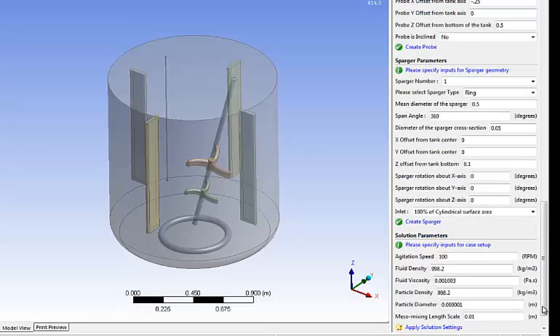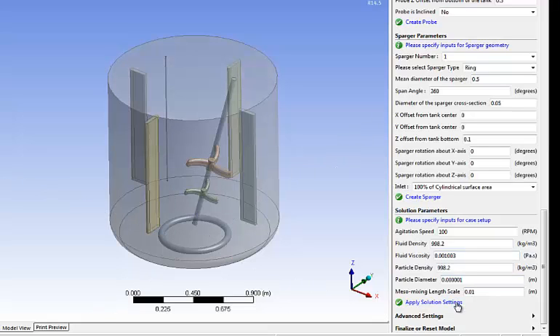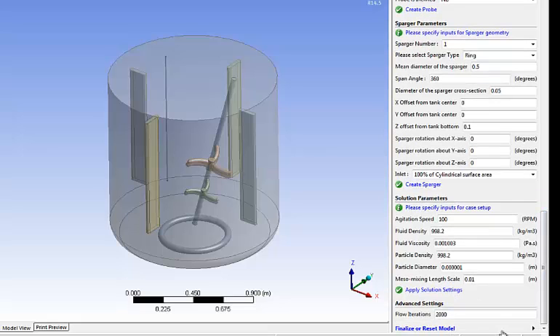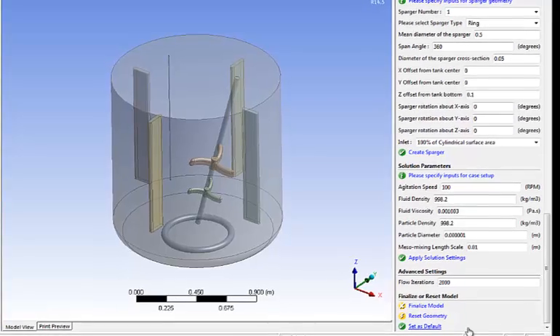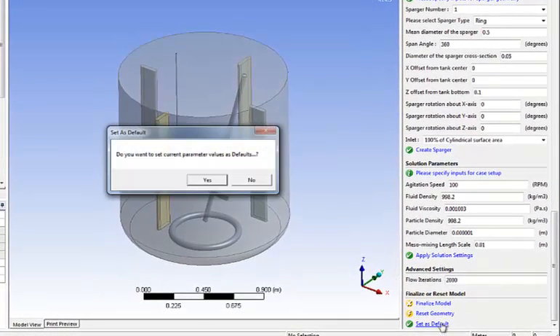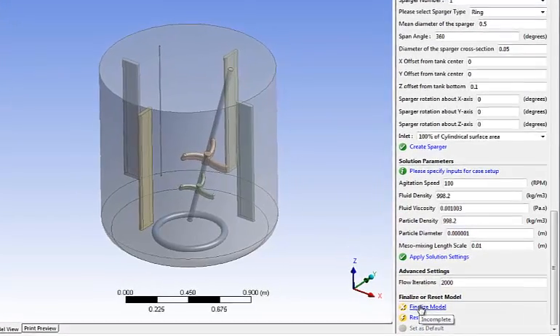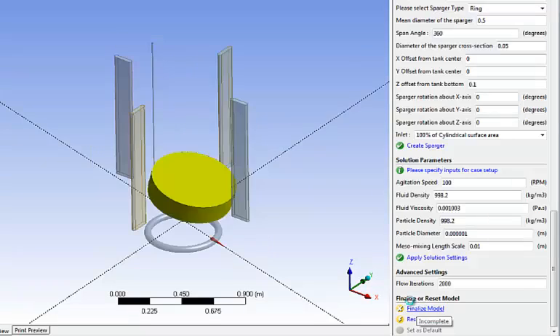Now solution parameters. What is the fluid density, viscosity, the agitation speeds, etc. Same thing. Simply enter it and click apply solution setting. Advanced settings. I'm going to run 2000 flow iterations. And last but not least, I don't want to re-enter everything every time. So I just set that as a default and I click finalize model.